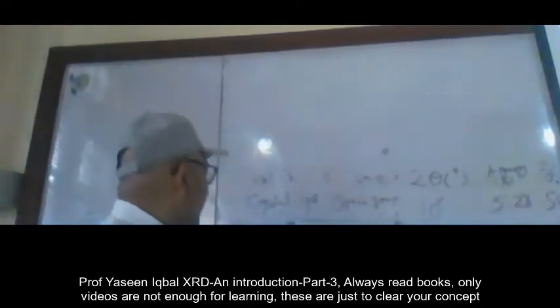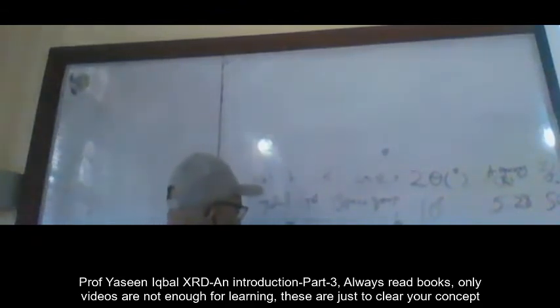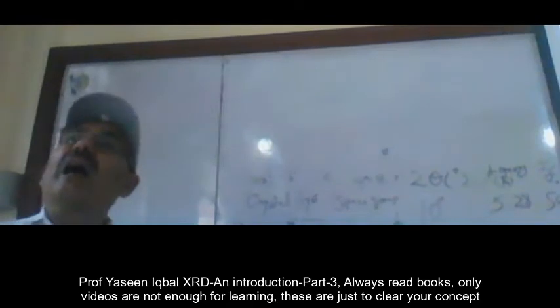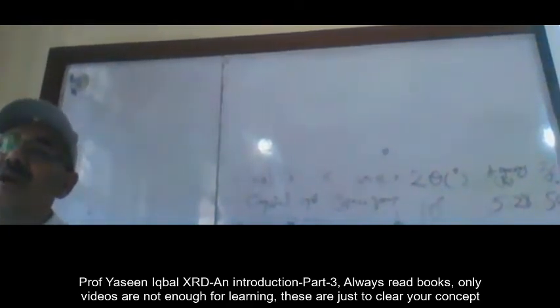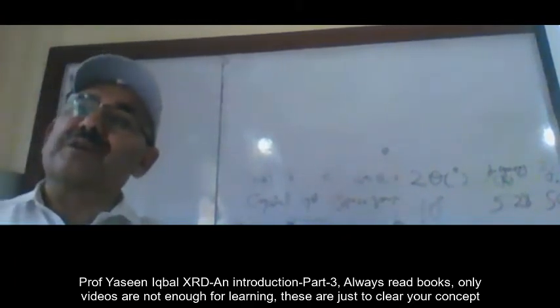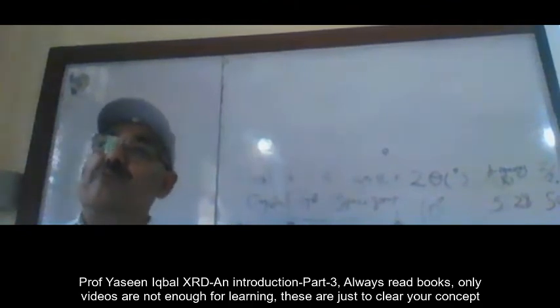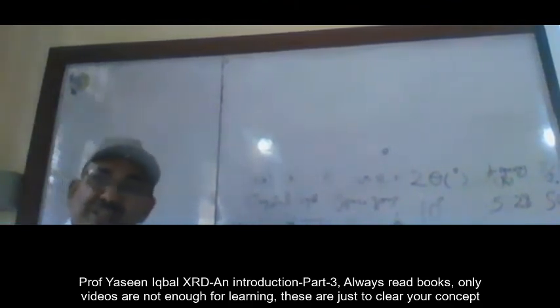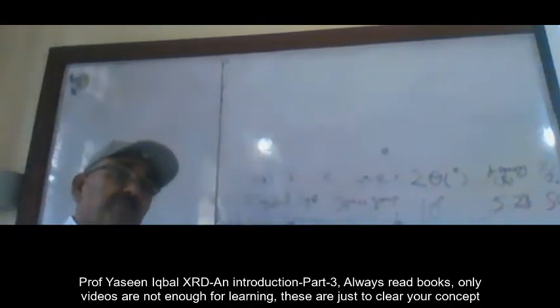If the BaTiO3 diffraction pattern was like this, and the standard data also look like this, because nowadays when you are doing things on the computer, the software also gives you the standard plots as well. So you can match your plot with the standard plots. You can superimpose them and you can measure them.